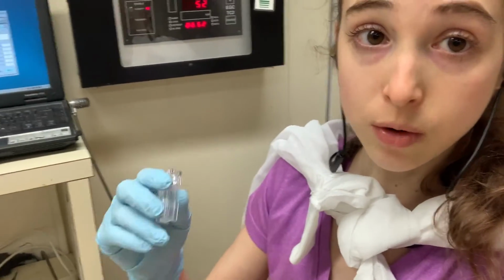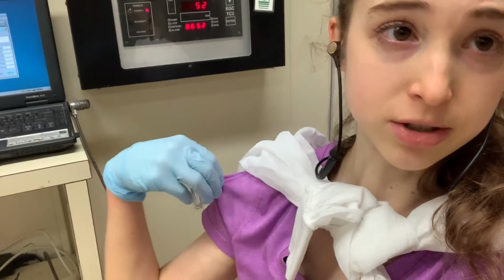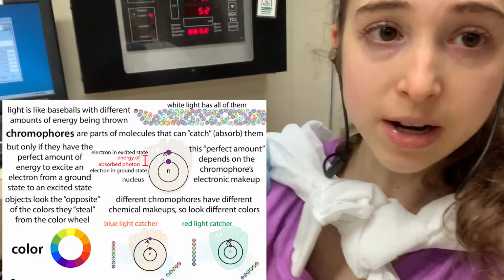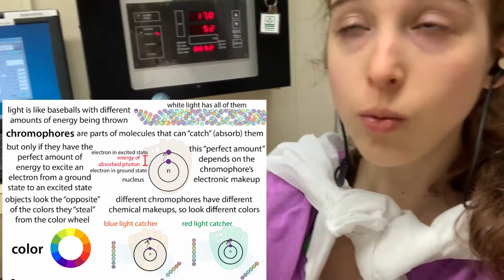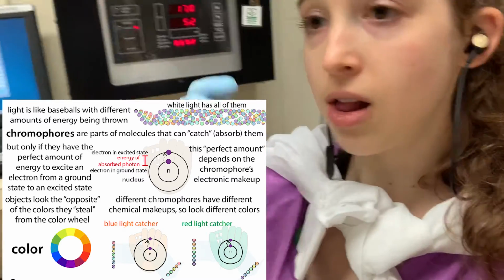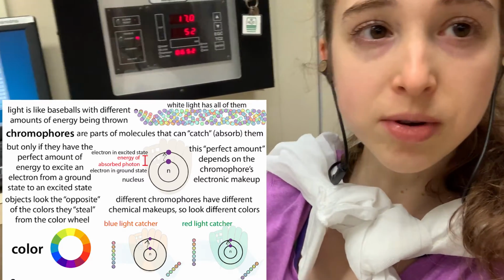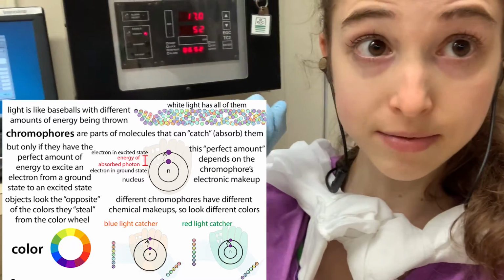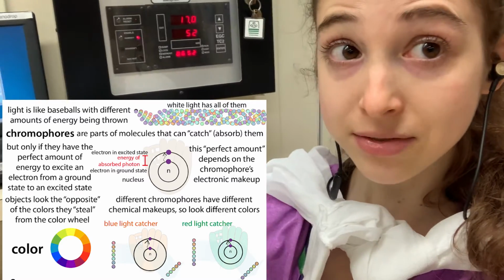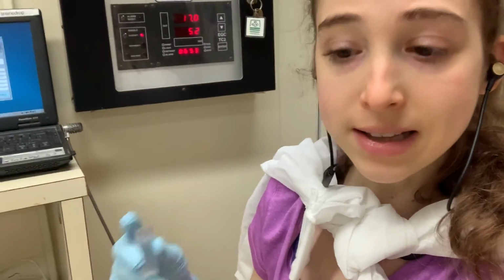Molecules can absorb light. When we think about colored things, like shirts, part of the reason why you see it as this color is because it's absorbing all of the other colors. White light is a combination of all of the colors of the visible light spectrum. So you can think of the molecules in my shirt as kind of stealing some of those wavelengths, and we can only see what's left over. And we can think of the same thing happening in the ultraviolet spectrum.